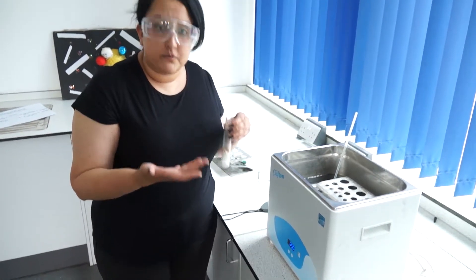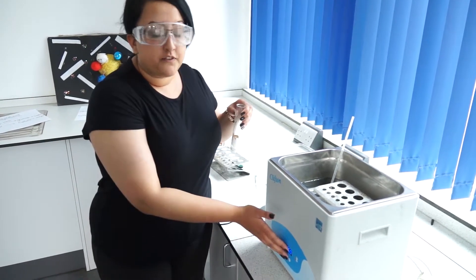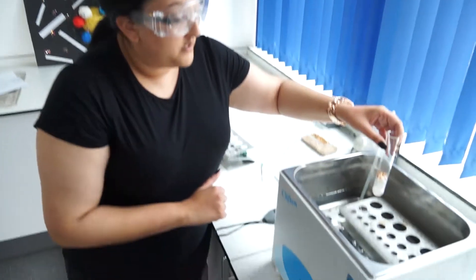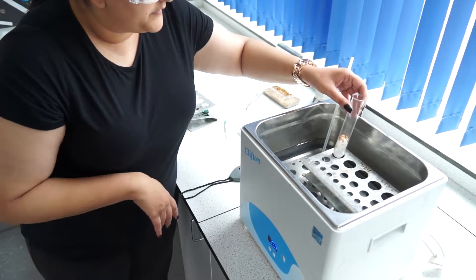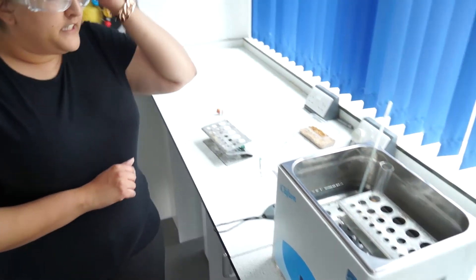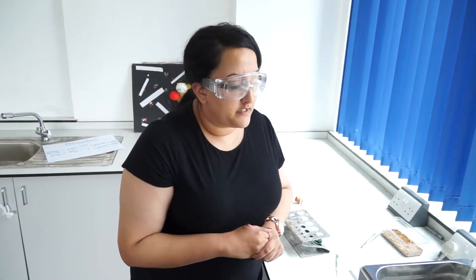You must use at least about 6 temperatures. Put your boiling tube in the water bath — the mealworms won't be harmed — and leave it for about 5 minutes. This is so the mealworms get used to that temperature.